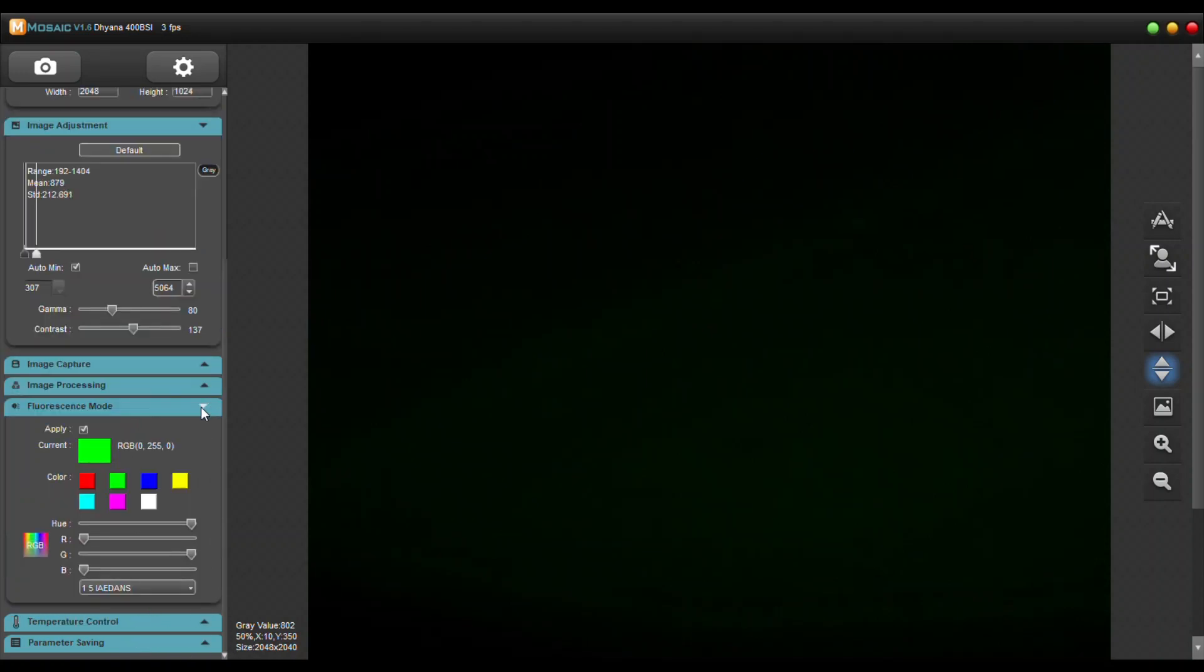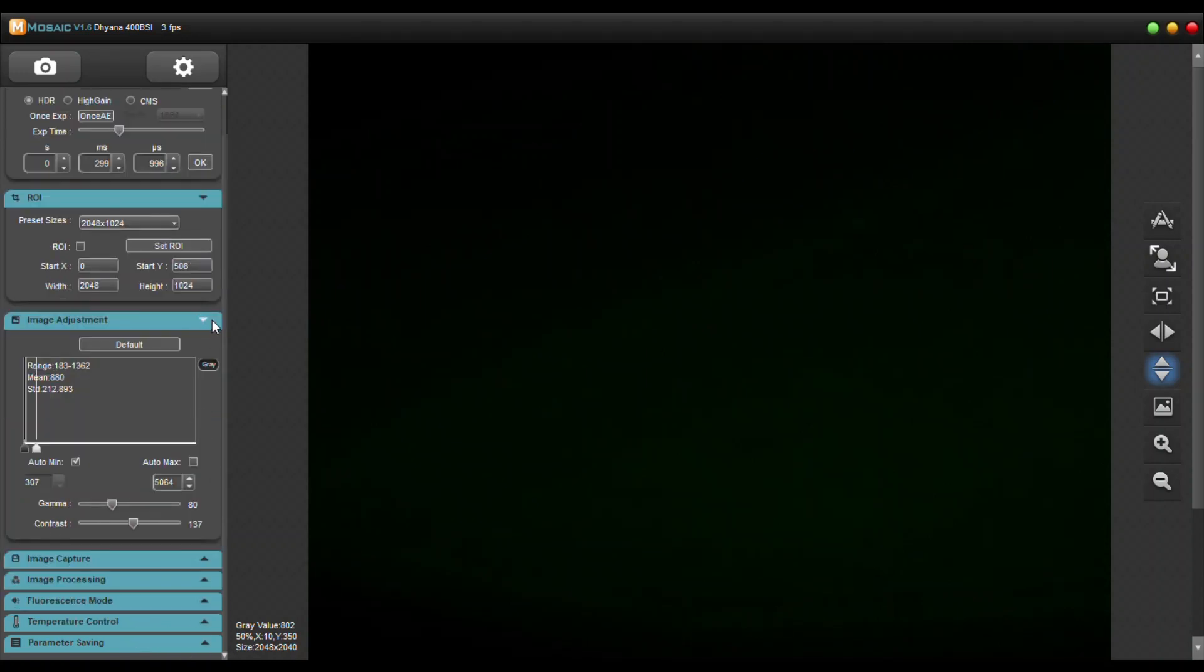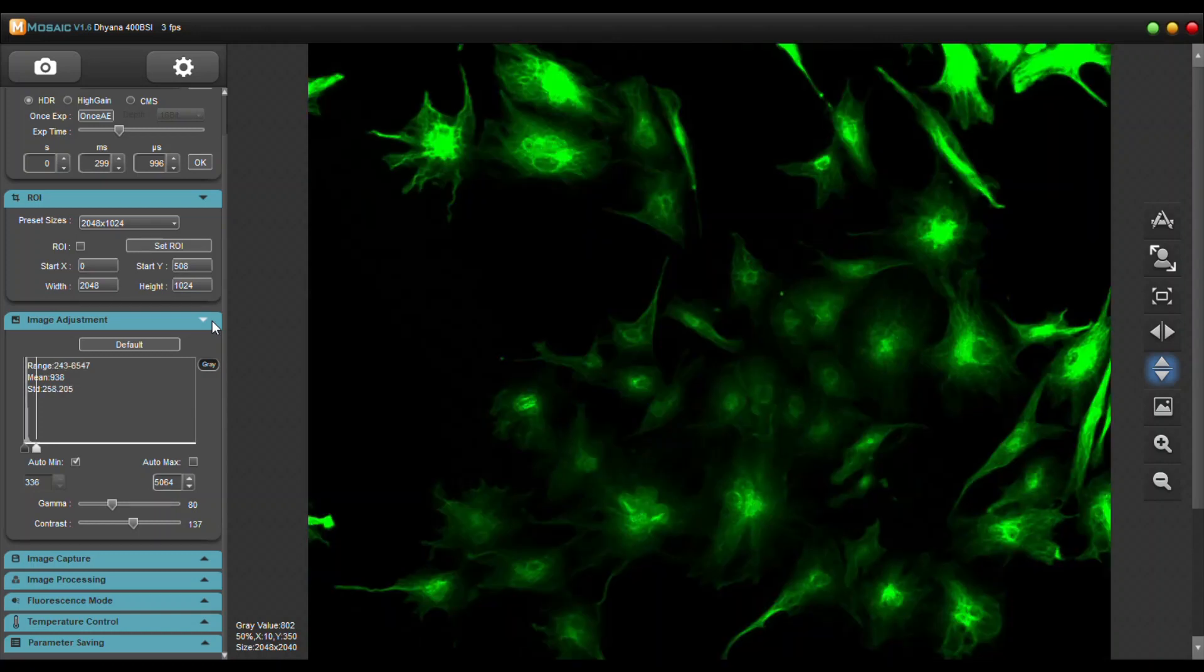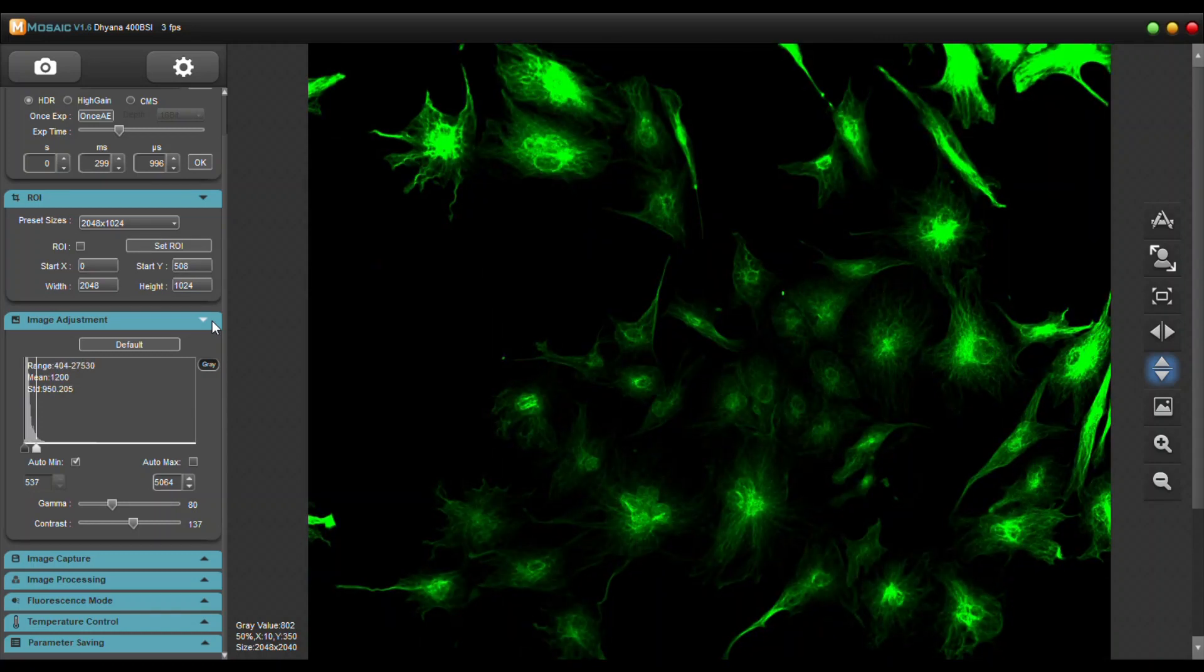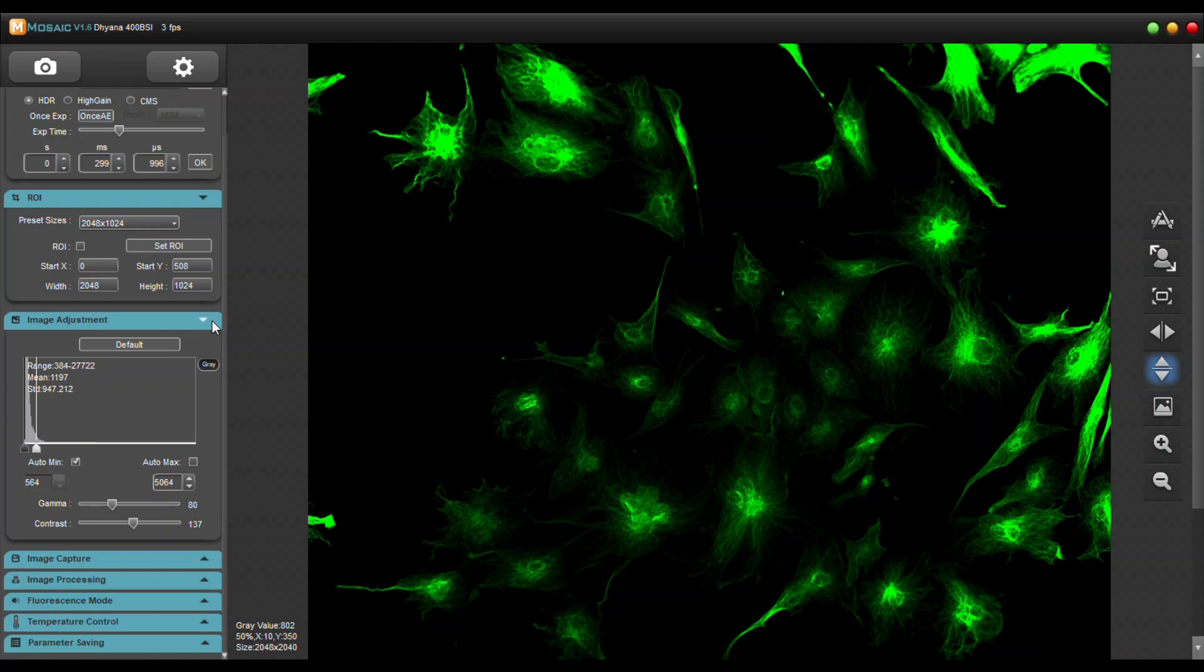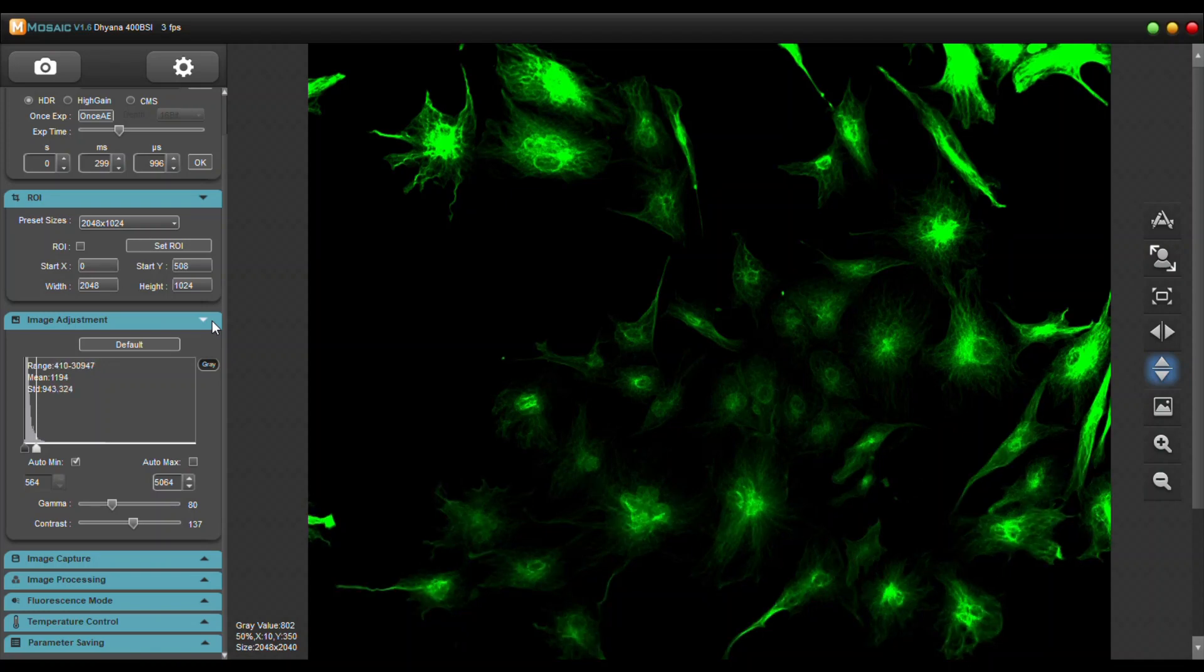So let's go ahead and open the slider on the camera right now. This is on our BX61 fully motorized fluorescent microscope and we're viewing this under a 20x objective.